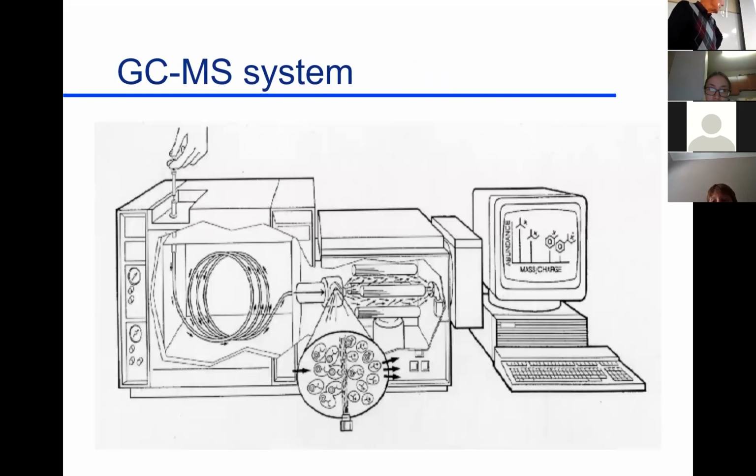And so that is the gas chromatographic system. We've got a tiny column here, not a bigger one as it shows here. It interfaces directly with the mass spectrometer, the quadrupole mass spectrometer you'll see there. And that gives us our system.